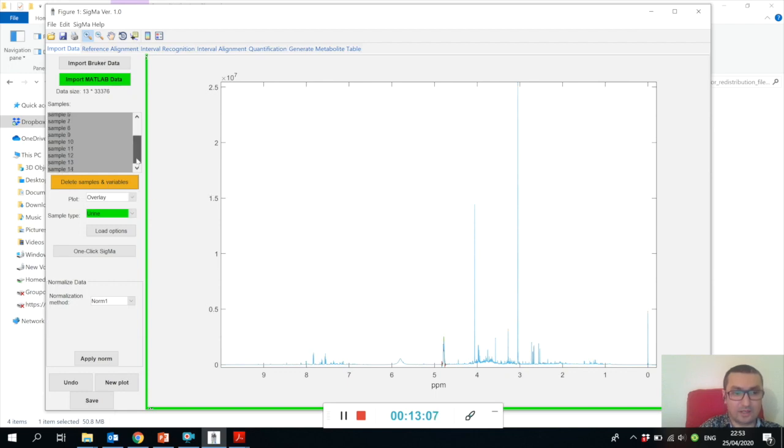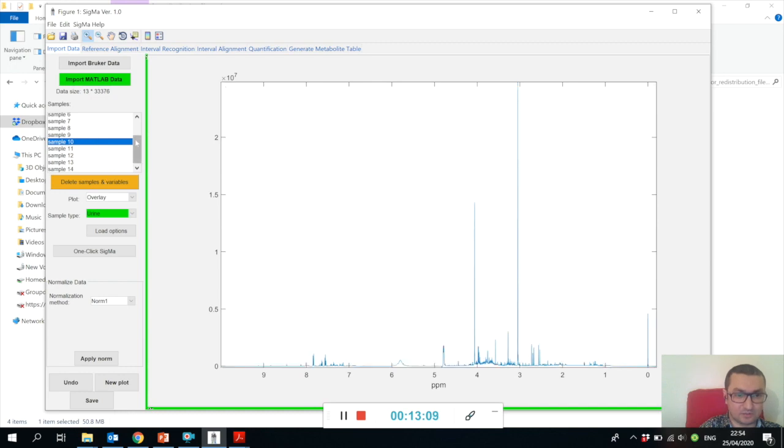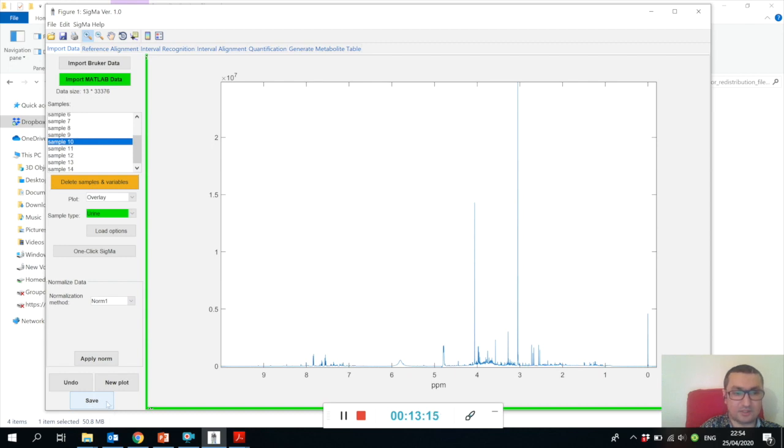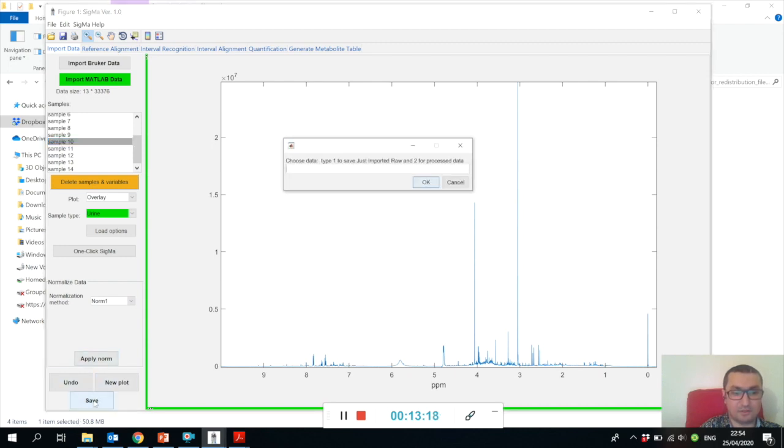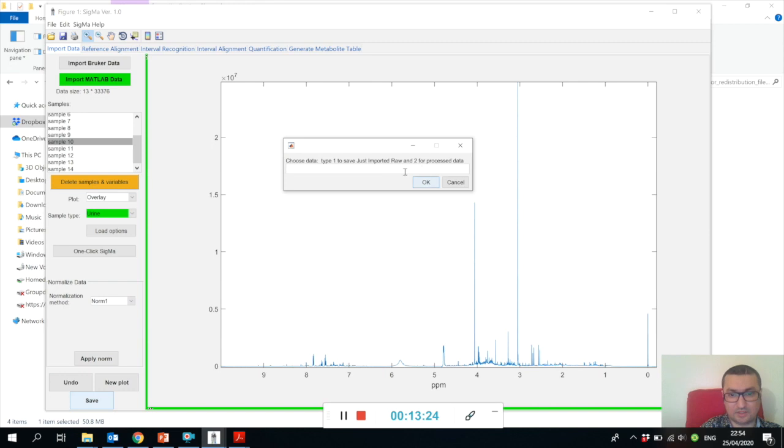Your data no longer has 14 samples but only 13 samples. We removed some NMR spectral region and we also binned by two, reducing our sample size. When you do some operation, the button that you press becomes orange.